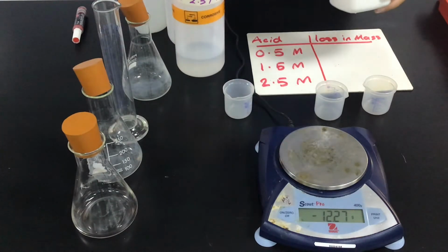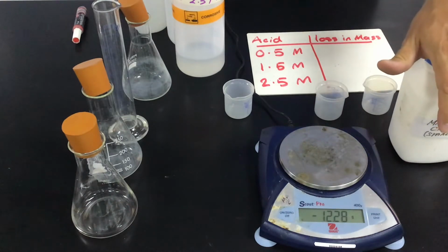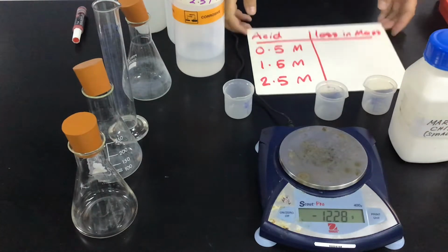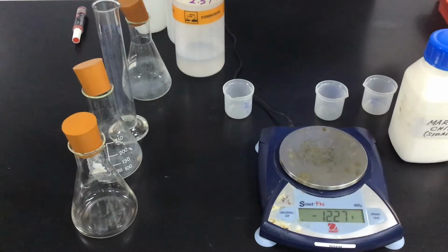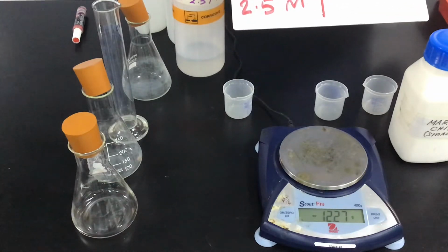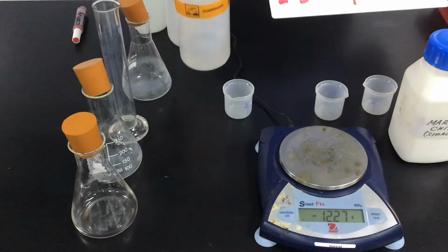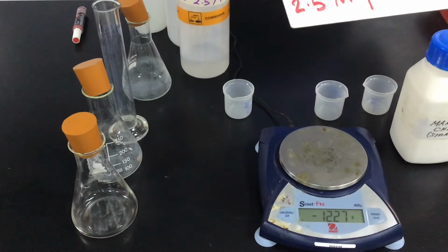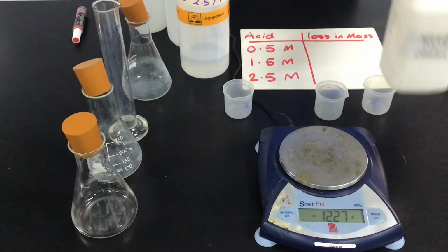That allows my reaction to happen faster. Does anyone think they know why? Have a think for a second. It's to do with the surface area. If you have a large chip, if you imagine this has got an edge around it, if I chopped it in half, it would have an extra 2 edges where I chopped it in half, which would mean it had a larger surface area, so more space for the acid to react with the chips. So that's why small chips react faster.